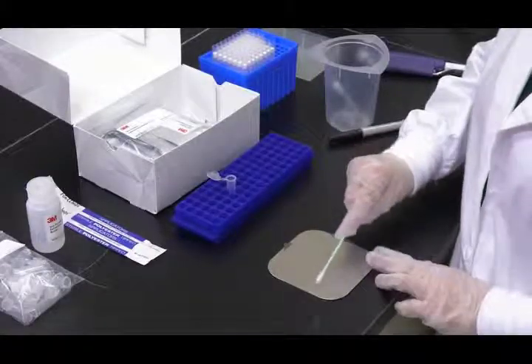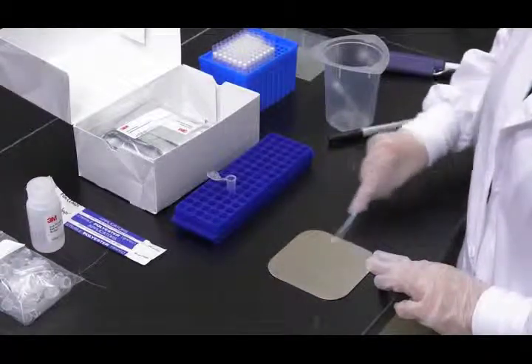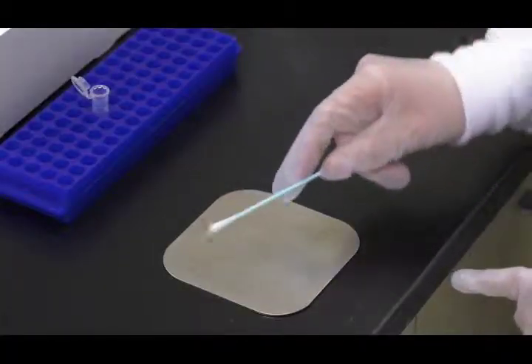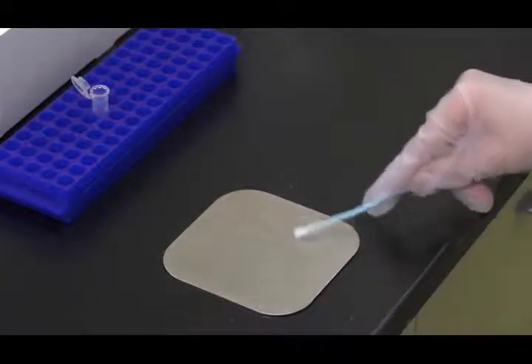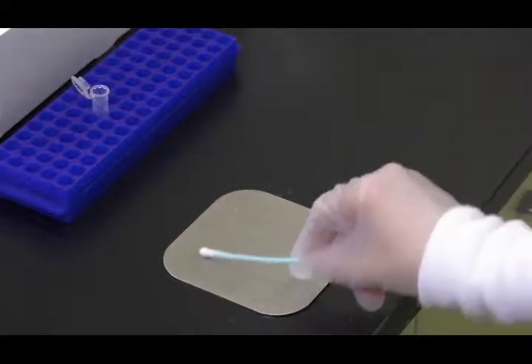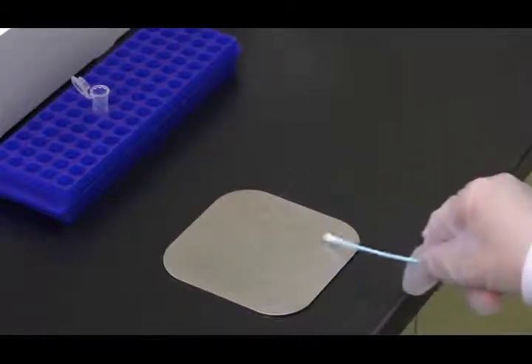Then take the wetted swab and survey a 10 by 10 centimeter surface area, maintaining the swab at a 30-degree angle with the surface. Rub and rotate the swab back and forth over the surface area, alternating directions three times for thorough coverage.